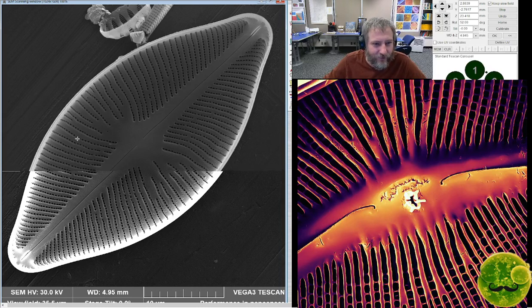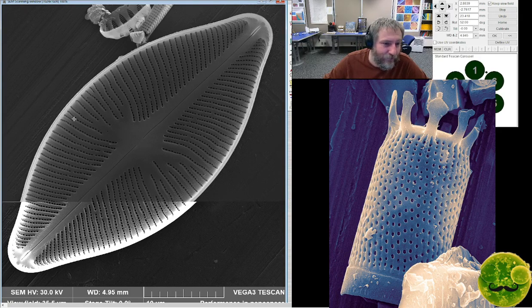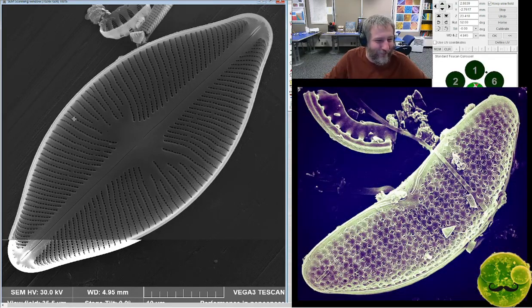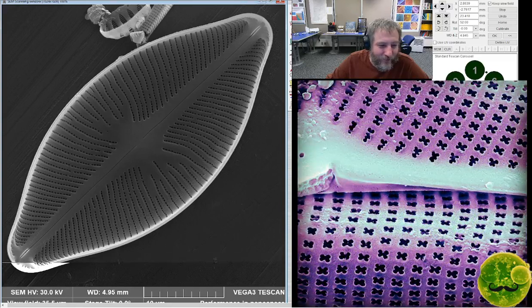And one of the first things I did when I finished my PhD was translate all of those from German into English so I could figure out what he was trying to tell us, because I was working on Lake Malawi at the time. And so I have all these translated from German using, I don't know, Google Translate or something. And then I tried to get some of it checked by friends of mine who are German, as much as they would put up with, hey, what's this say? But a lot of the original taxonomists were German, and most of them came out of Germany for diatom work, and this is looking pretty good.